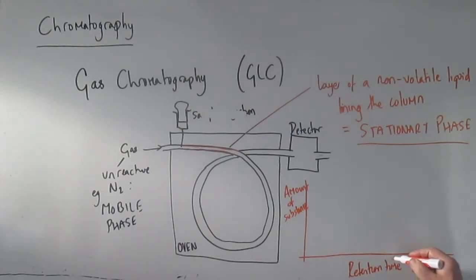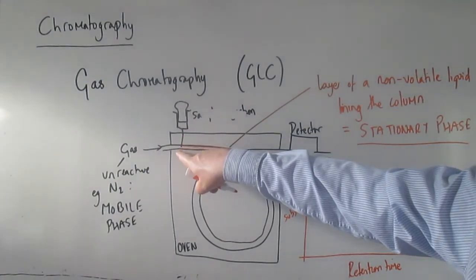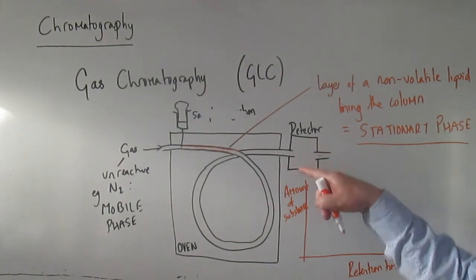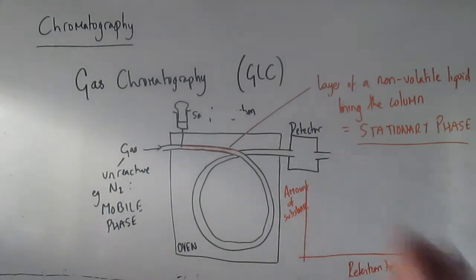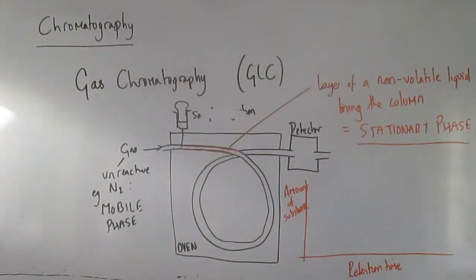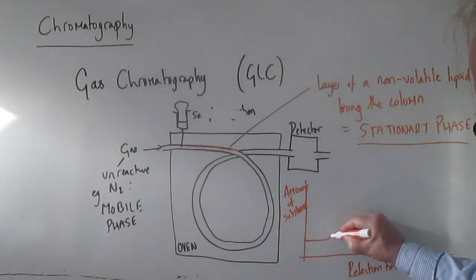Okay, so the retention time is the time between when the sample is injected here and when a particular substance arrives at the detector. Depending on how long your tube is and how fast your gas is flowing, that can be tens of minutes. So we're talking about a long journey that these substances have to take. So different substances have different retention times, and so what you get is a trace that might look something like this.